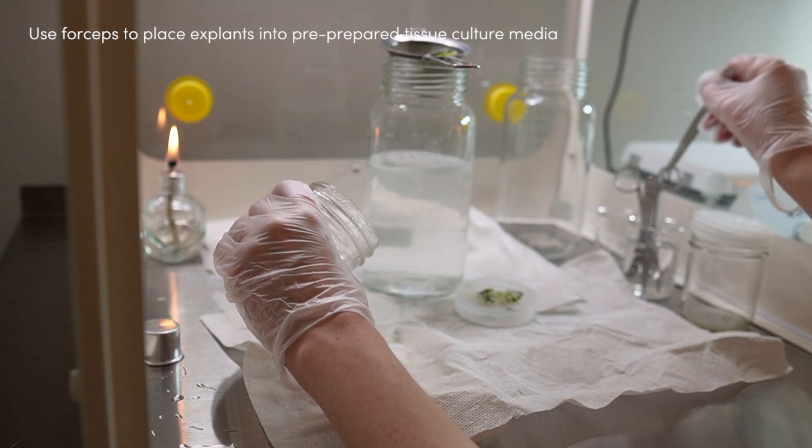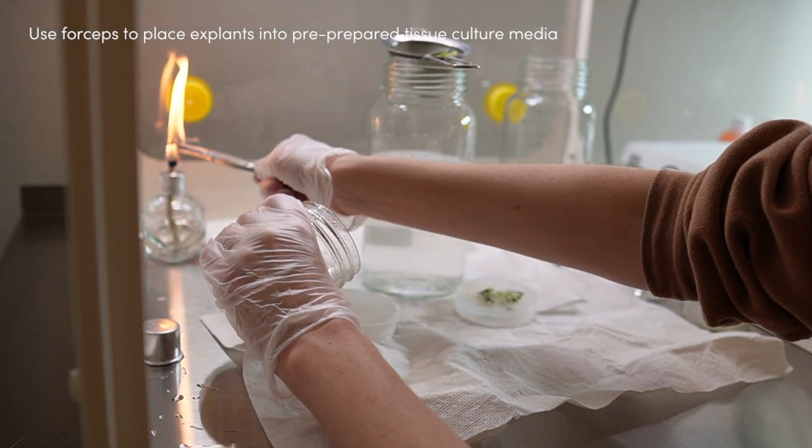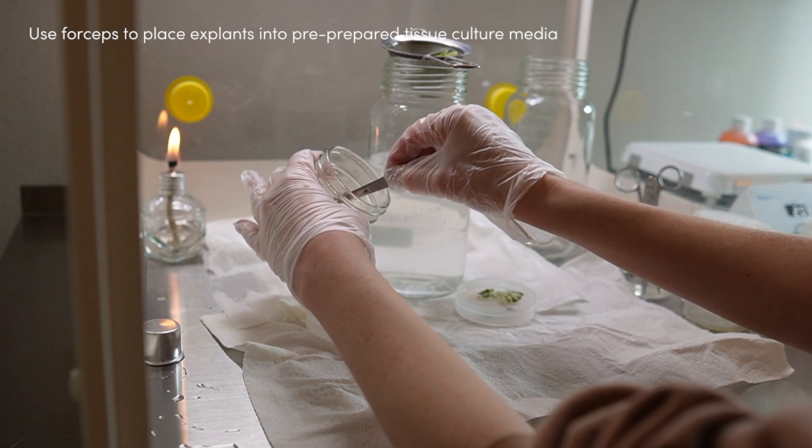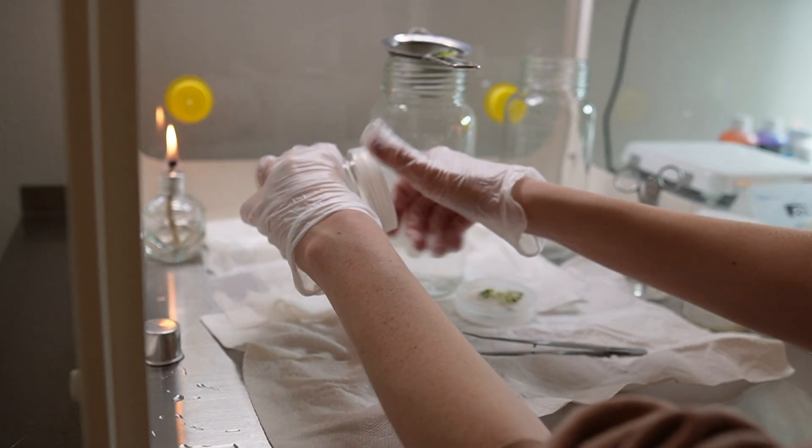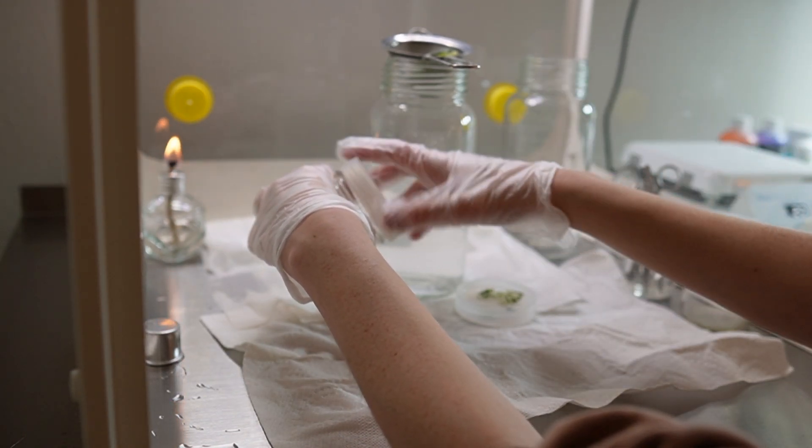I'm placing the explants into media that I had pre-prepared in another video. I highly suggest you watch it. Making media is the easiest part of the tissue culture process, in my opinion, because it doesn't really need to be done in a sterile environment since you autoclave it at the end.